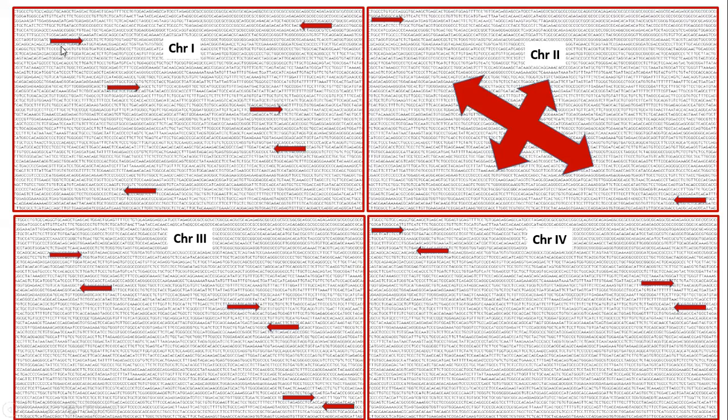In a typical chromosome 1, they may bind here in forward and reverse direction. There are more forwards here than reverse, 4 forward and 2 reverse. It may be a typical pattern here, we'll see that. In chromosome 2, no binding at all, or binding is there in terms of annealing, but the forward and reverse primers are too far away. Only one primer site was there, they are too far away. Let's say this is the annealing situation. Chromosome 3, you have 1, 2, 3 patterns. Chromosome 4, you have 2 patterns of annealing, forward and reverse primer.